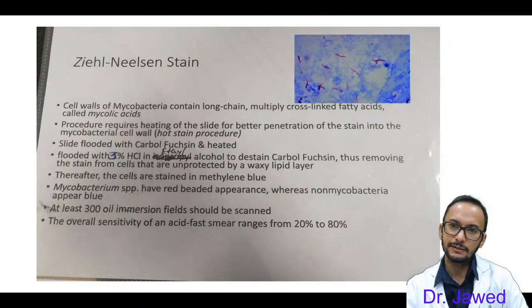What we'll see is that Mycobacterium will look like a thin, slender, long, pink organism with a beading appearance. It looks like a bead. So this is basically used for staining the acid fast organism. The whole background and the other organisms will be bluish in color, and this Mycobacterium tuberculosis or acid fast organism will stand out and appear as a pink organism.